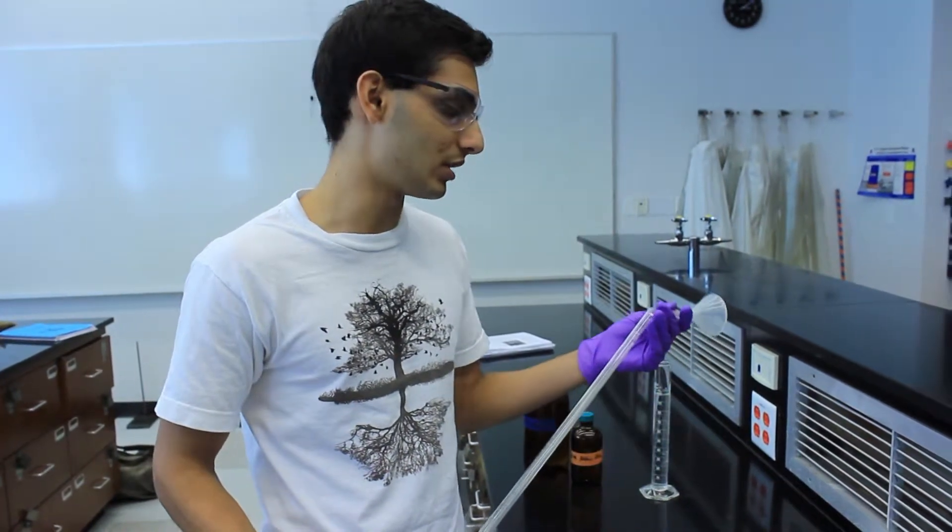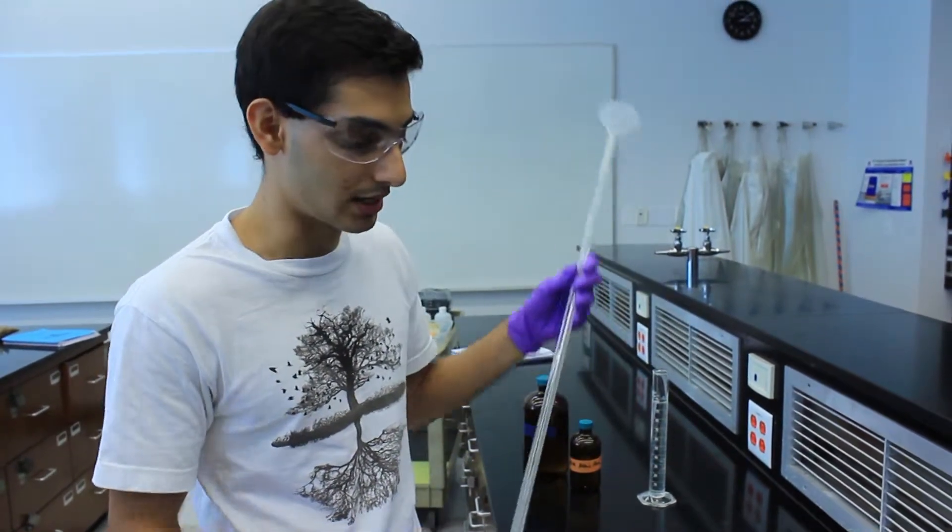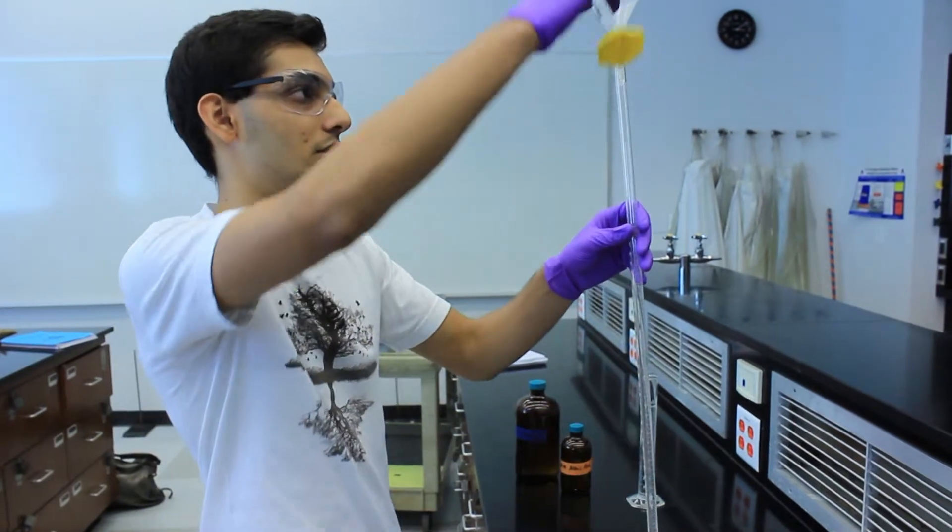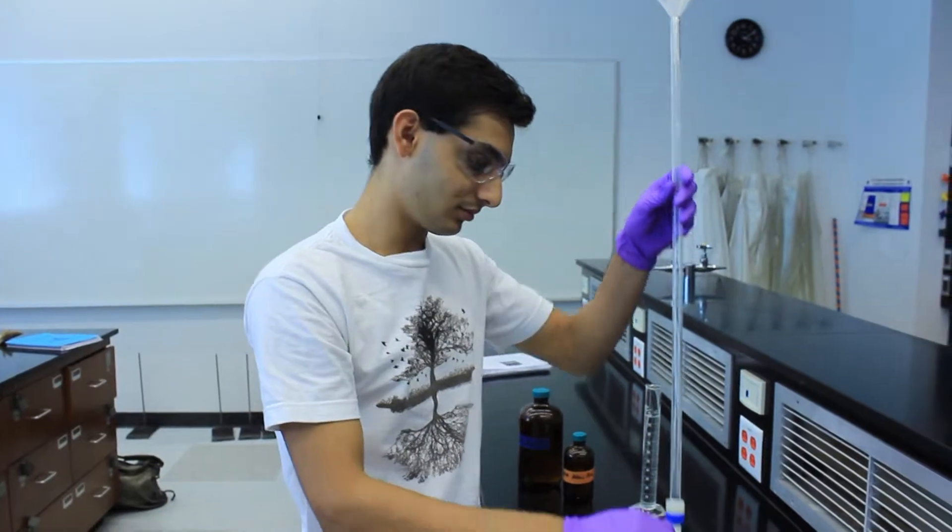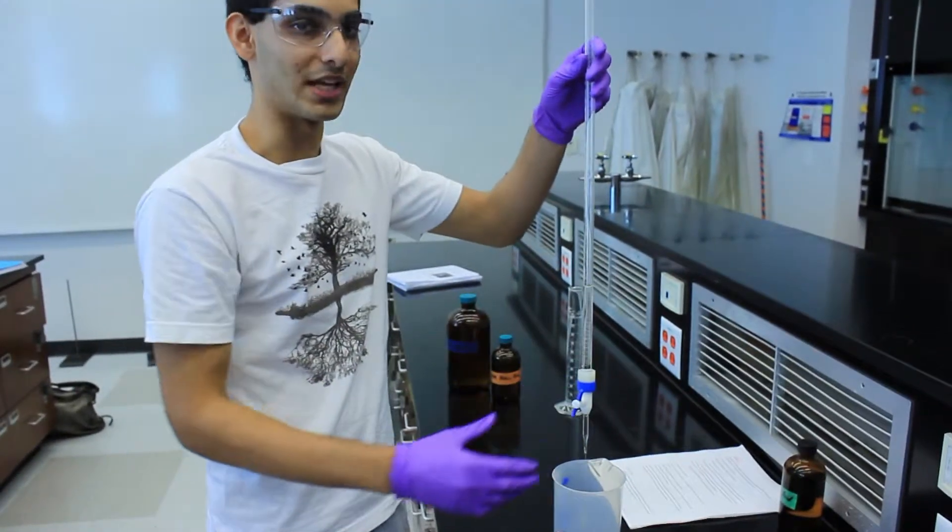Before you start the titration, you need to prepare the burette. In order to do that, you need to rinse it with sodium hydroxide. Take 10 milliliters and just pour it into the burette, and then empty it into a waste beaker.